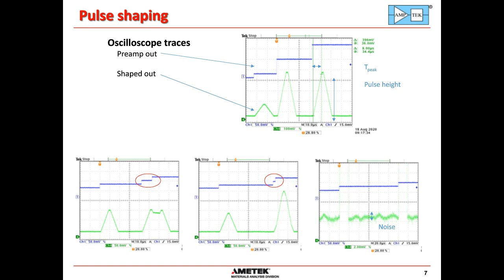When that large reset signal occurs, there's a distortion in all of the electronics because of saturation. And so we have a reset lockout period, which means we don't record data for the time it takes for everything to restore to normal. So that's what the reset lockout time is. It's the time when we stop data acquisition to let everything return to normal after there has been a reset.